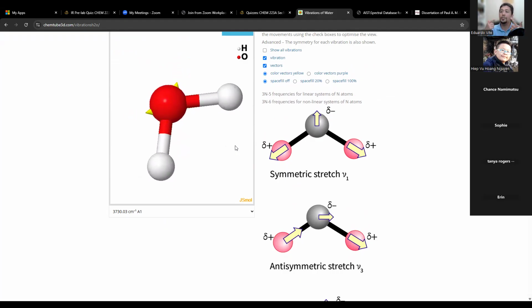So it has to be a symmetrical stretch in such a way that the dipole vectors cancel each other out. I hope that makes sense. And it's possible for one molecule to have one stretch that is symmetrical, but another stretch that is asymmetric. And so that asymmetric stretch does show up as a signal. Yes, so it will still fit both conditions in the end, right? The stretch itself has to cancel out.